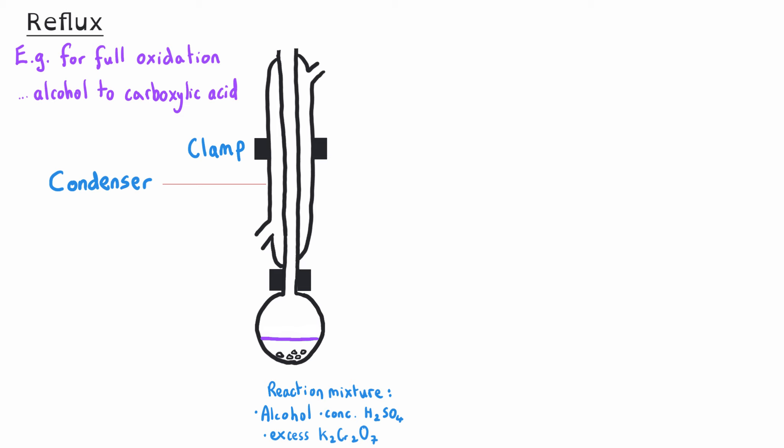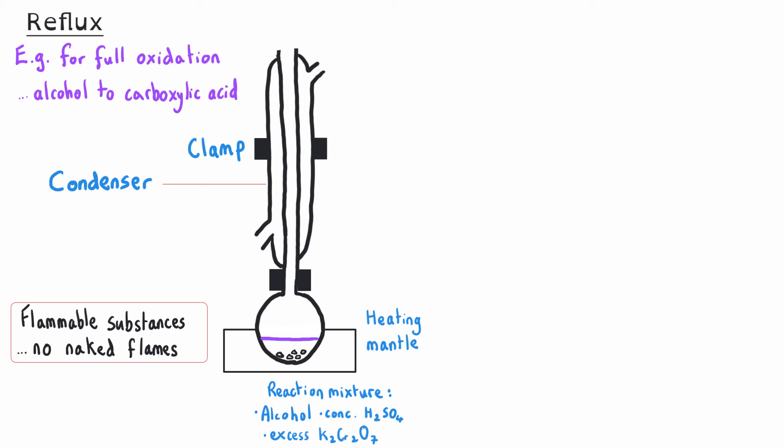The condenser must be in the vertical position and should be clamped, and we should also clamp the reaction mixture to make sure there's no dangerous slipping of the apparatus. When we do the reflux, it's really important that we heat our reaction mixture using some kind of heating mantle, hot plate, or maybe a hot water bath. We must not use any naked flames, because most organic substances are highly flammable.